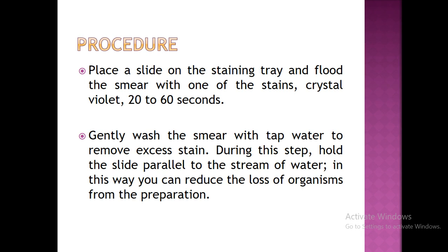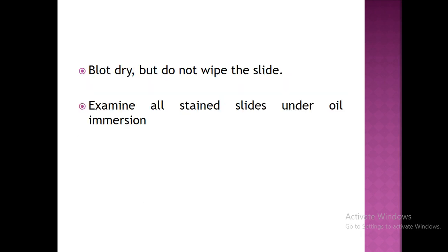That will reduce the loss of bacterial cells from the preparation. Blot dry the slide, do not wipe the slide, and then place a drop of immersion oil and observe under the oil immersion objective. This is the simple procedure of the staining.